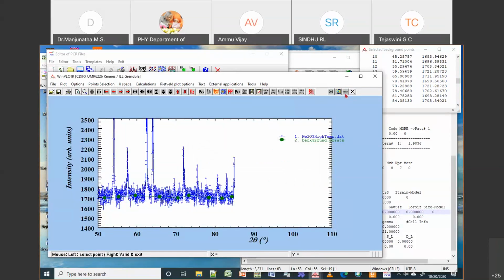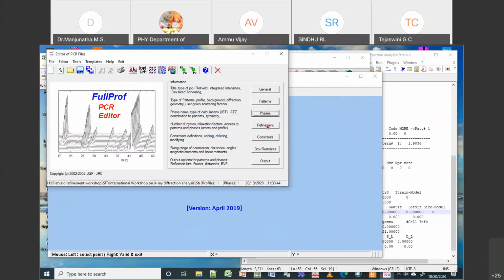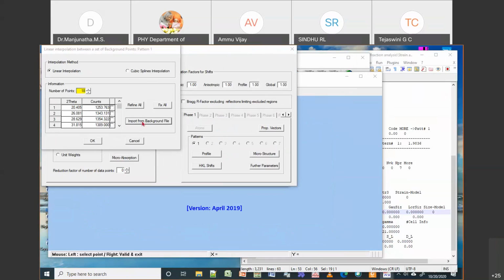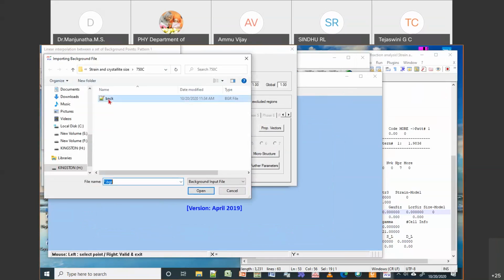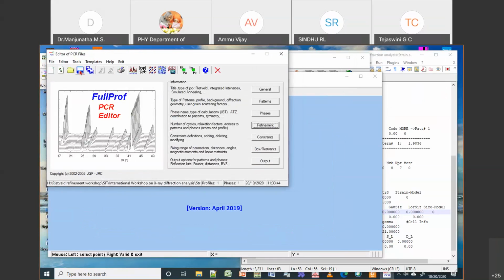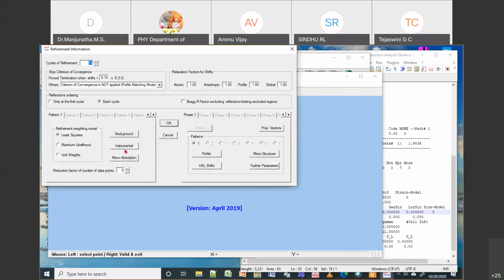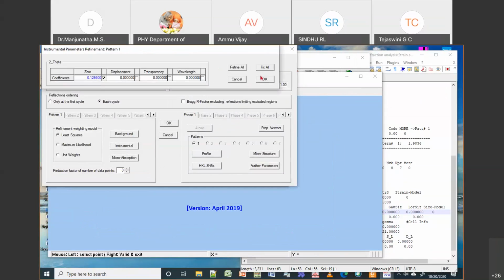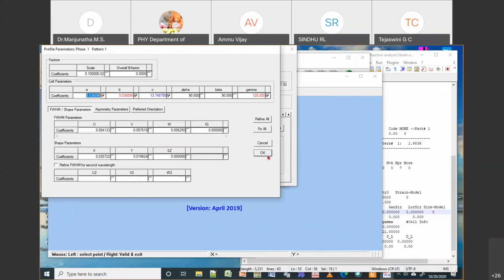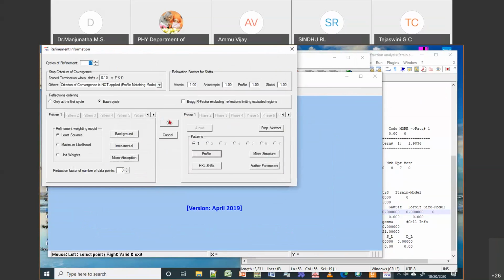Then I can go here in the refinement and import those things. Import the data points, which is here 19 data points. Okay, so it is fine. Right now it is ready to run. So make sure we have 0 running, and even your ABC is checked. So this needs to be checked. They are running.